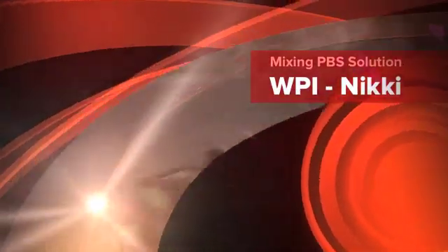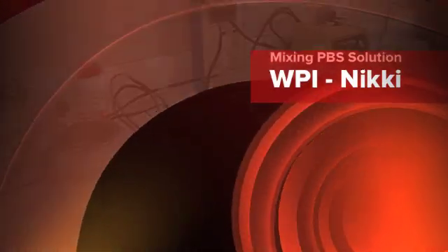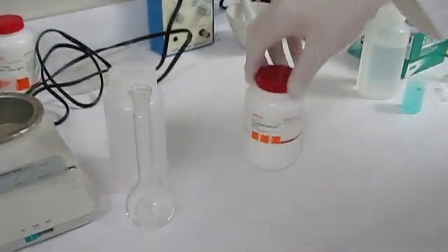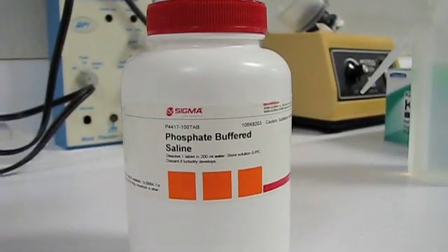Now the other one I'm going to show today is our 0.1 molar PBS solution, and again we use Sigma. These are actually tablets from PBS phosphate buffered saline.